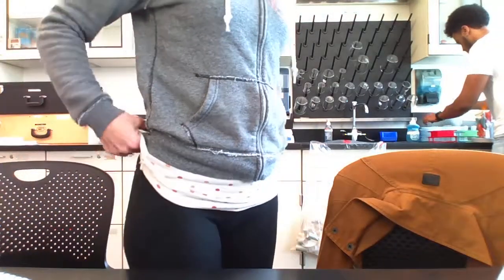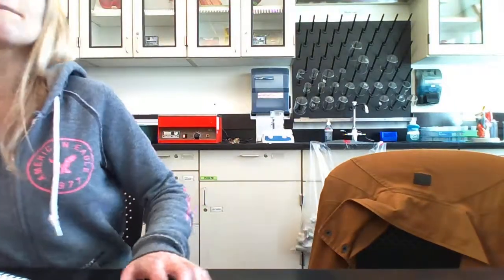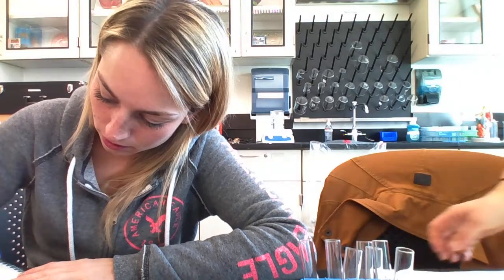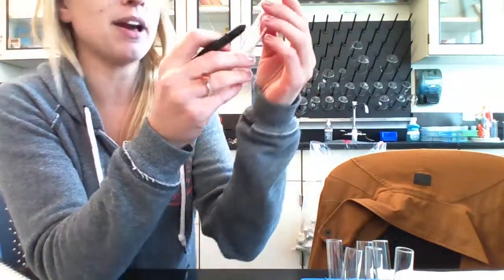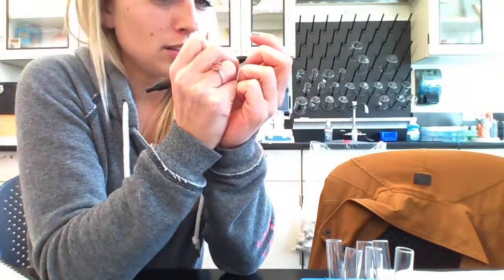Do we have a wax pencil? Okay. So since you're labeling, use your first initial and then do 1, 2, so S1, S2, S3. And then you're going to do an S4B and an S5B. We do have a wax pencil. Sorry, I didn't realize that we had one already. So you said S1 through 4 and then S4B and S5B? S4B, S5B, yeah. That way we can just line them up.